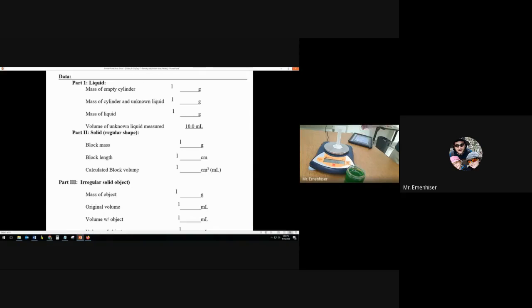And then we're going to put the graduated cylinder on the scale, and it's going to tell us our mass. And you can kind of see that. What is that? 7.06 grams. And the mass will fluctuate a little bit. It'll go up, it'll go down, and sometimes you just have to pick a number because it's going to change rapidly. So 7.06 is what I'm picking.